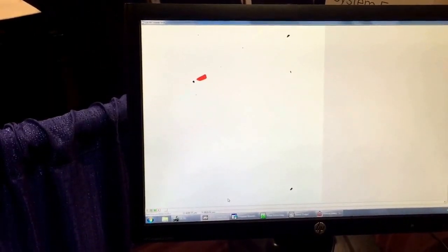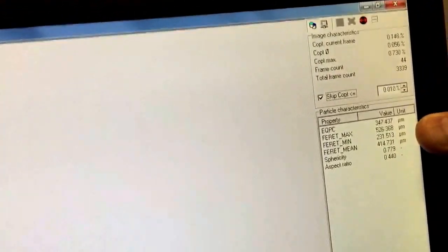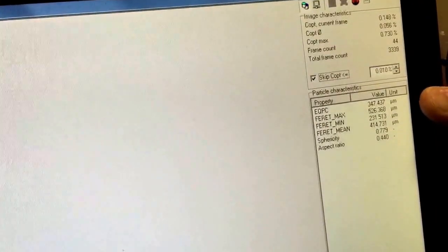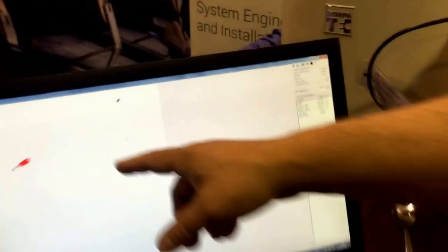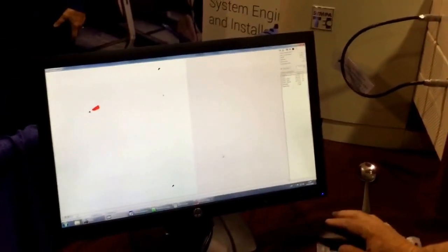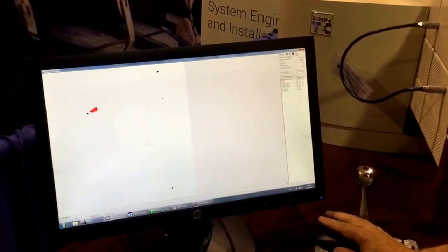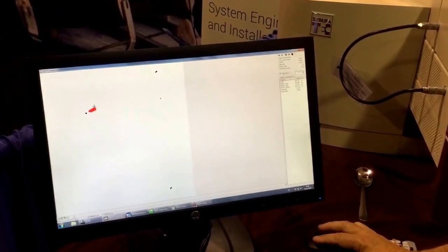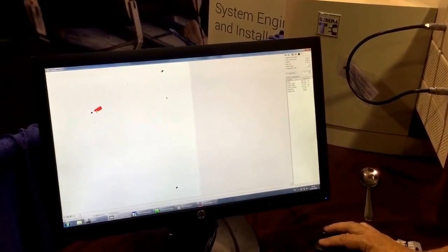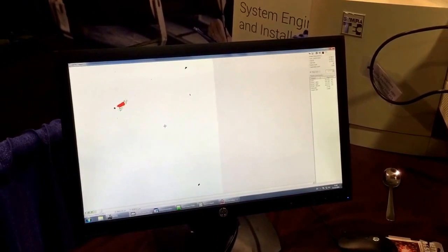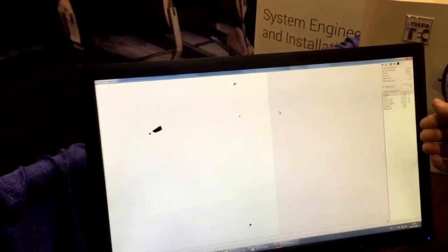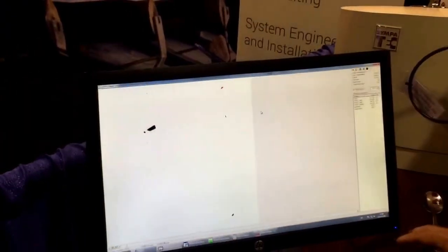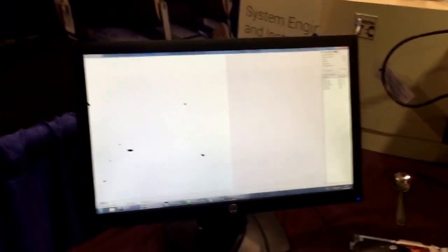And it shows me what frame that particle is in. That's the particle, it shows me all of its criteria. Minimums of 231 microns but maximum of 526 microns. And that's the guy. And if I wanted to, maybe there's another orientation I want, I could take it over there. Now it's going to show me what that size is. But I can click on any of these guys, on any of these frames, and it immediately comes up and tells me what the data is on that particle.